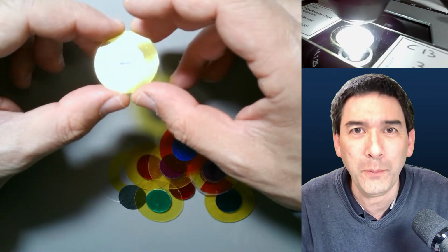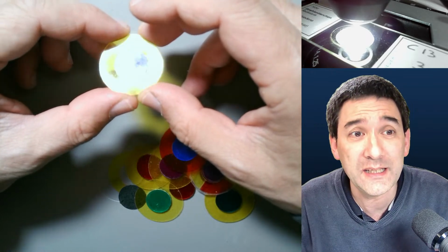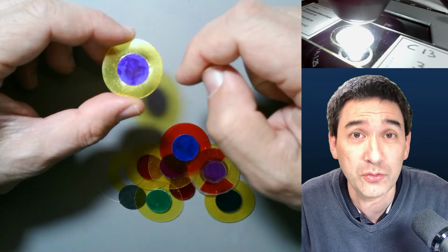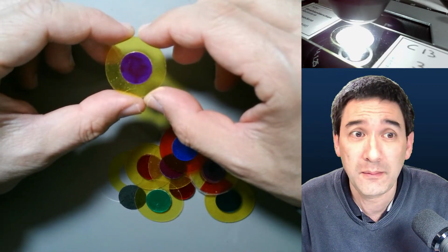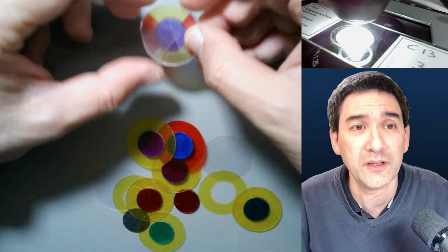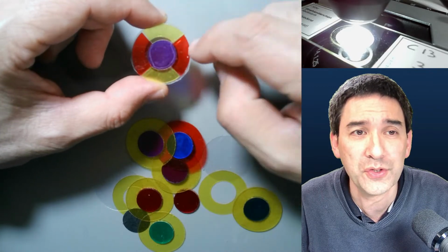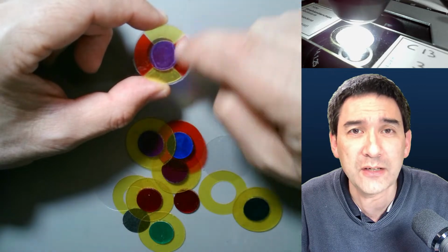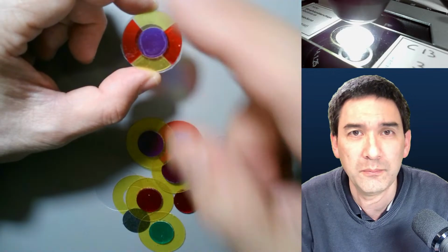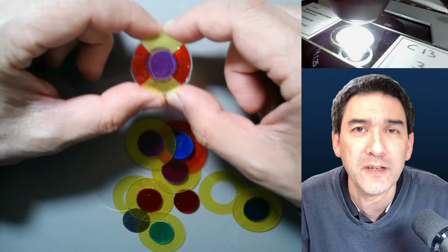Okay, let's put it this way. There are a whole bunch of other possibilities that you might want to try. For example, people have been using polarized filters. You can try that, or other variations, like for example having this one over here. It's something that I try to make. It has been recommended that you make those filters like this, because it will scatter the light depending on which way the specimen scatters the light. Parts will be yellow in one direction and red in the other direction. So again, it is very specific for the specimen.